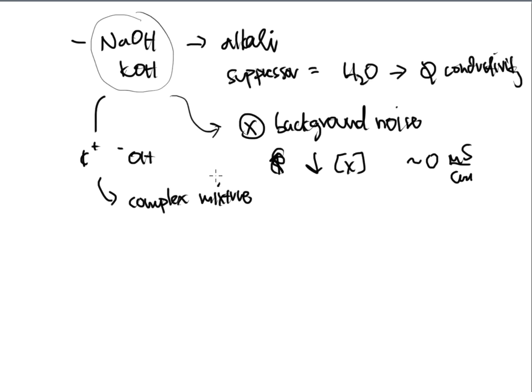And that's because, unlike the bicarb-carb, this is just really giving me one version of an anion with one charge and a cation with one charge. There's not a combo unit that's coming along here.